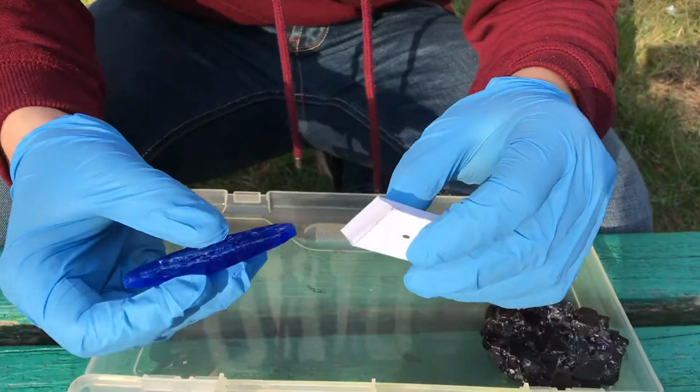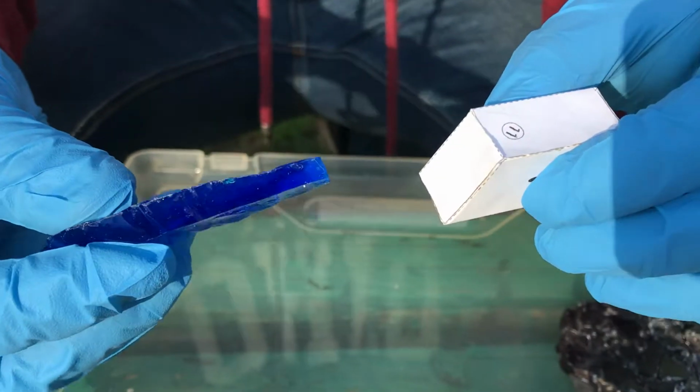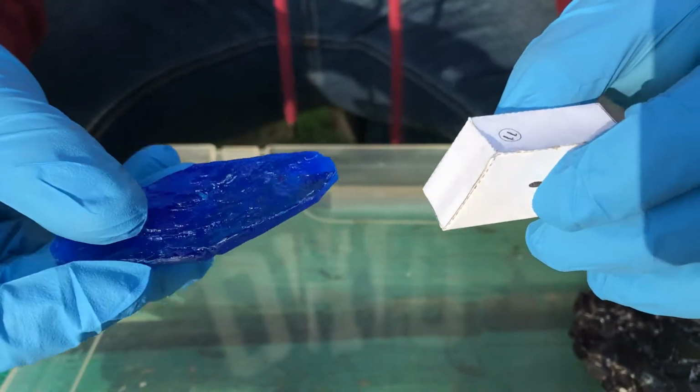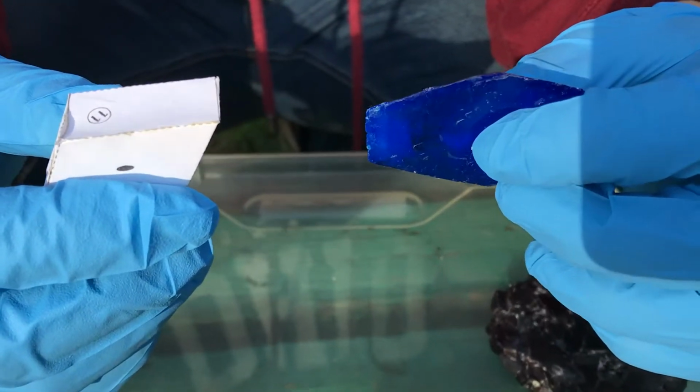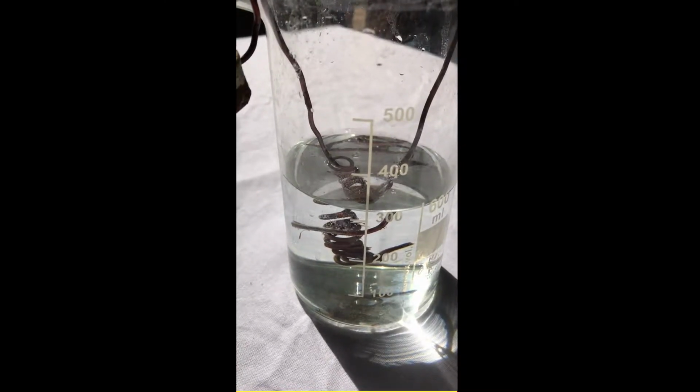Next on the list are the copper sulfate pentahydrate crystals. I have 2 of them. One is grown from the substance that I have purchased in a garden shop, and the other from a salt obtained by electrolysis of the sulfuric acid with copper electrodes.